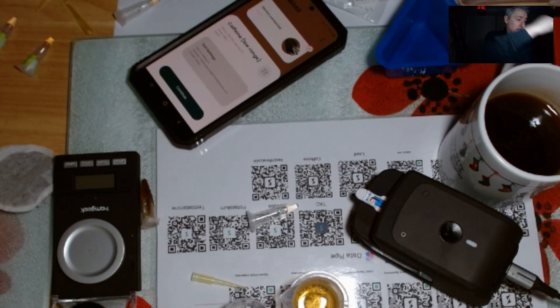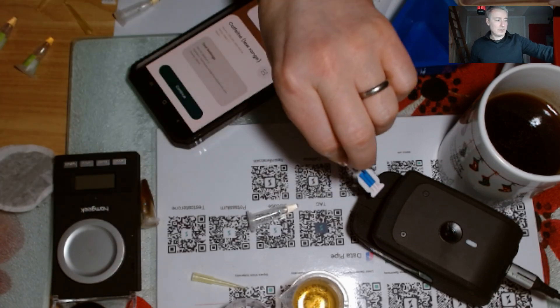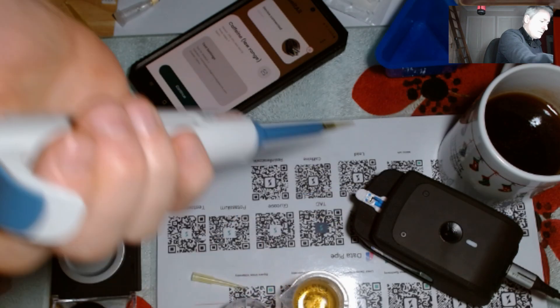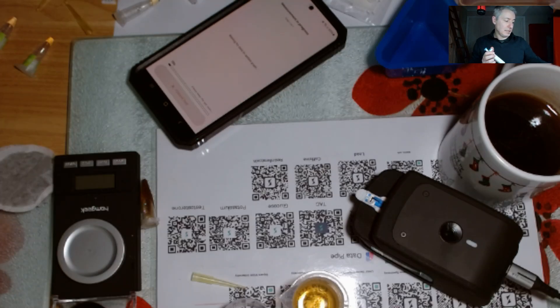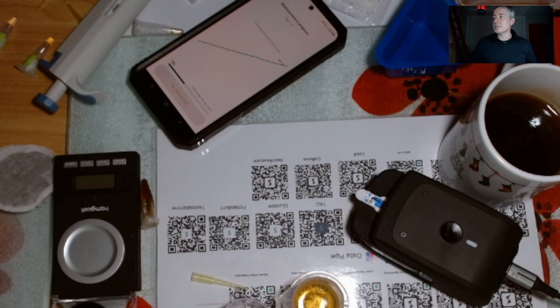I'll put a clean sensor in, snap it shut, and put 50 microlitres of that sample onto the sensor. The software is calculating for this dilution automatically — you don't have to do these calculations, it's all taken care of in the software. I'll flip this open, grab my 50 microlitres, hit 'Continue', then 'Start Measurement', and off it goes. For the tea we got 0.173 milligrams per gram — let's see what we get for the Red Bull.